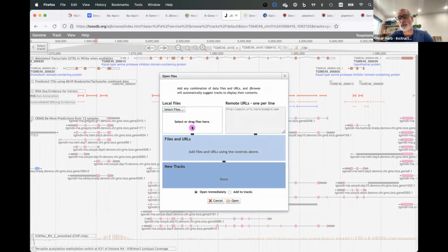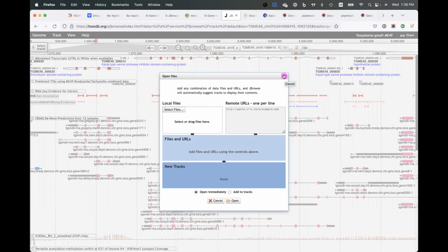You just have to make sure that the bigwig file data was aligned to the same version of the genome that is in the database. Once you do that, the coverage plot should show up here. Uli, does it work the same way in Apollo? Yep, I just checked it. Yes. Perfect. Thank you.